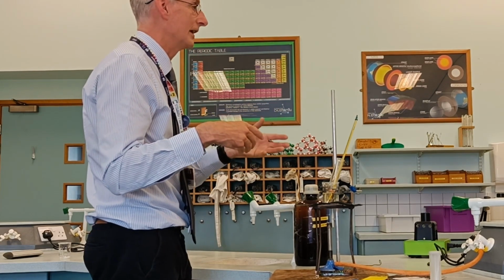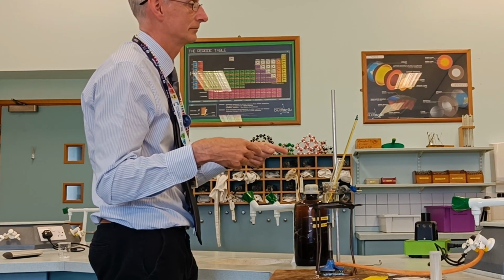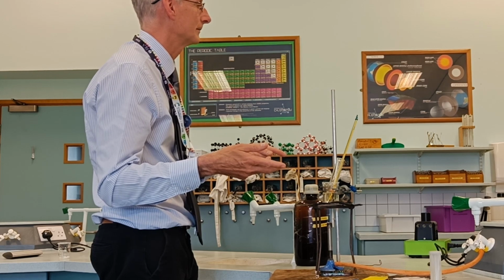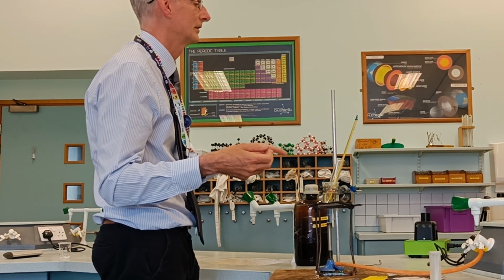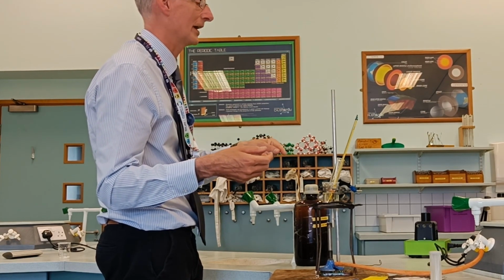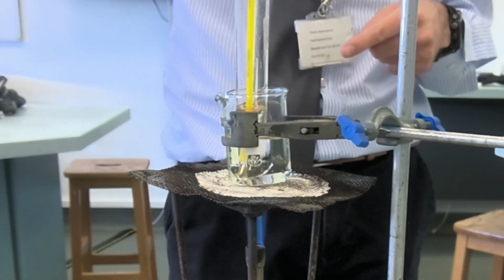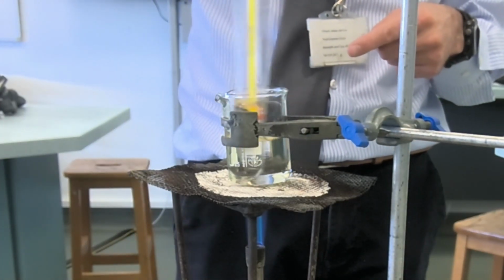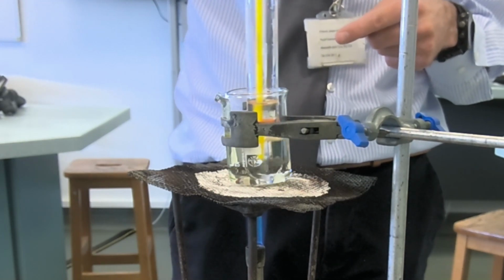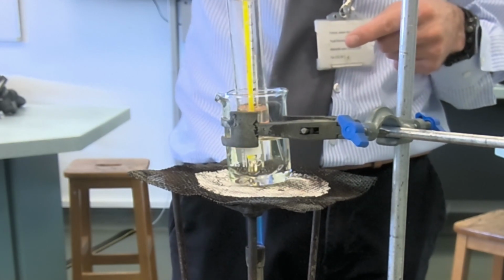Now, it's a bit like titrations. Your first reading that you get is rough, okay? So you don't actually ever use the first one. So you need to do at least one rough and then one accurate. Better still would be one rough, two accurate, if you've got the time. So this is up to 70 degrees now. I don't know if you can notice, but the liquid is starting to get a bit more runny, less viscous as it gets hotter. And we're up to 80.